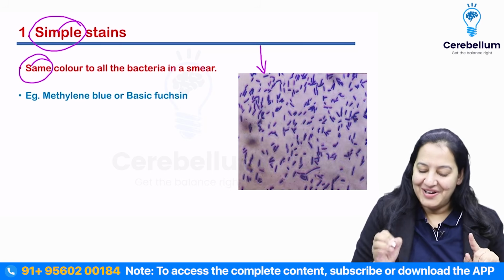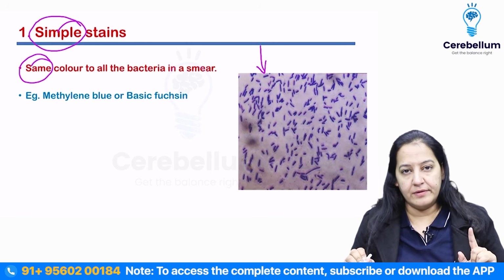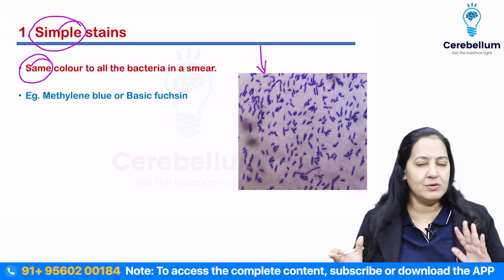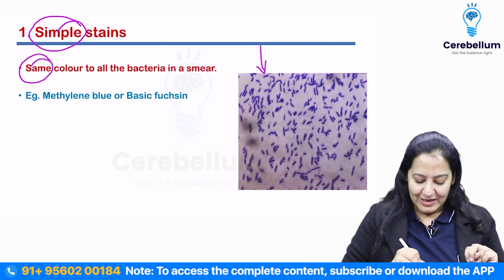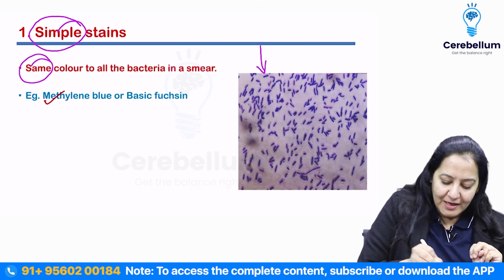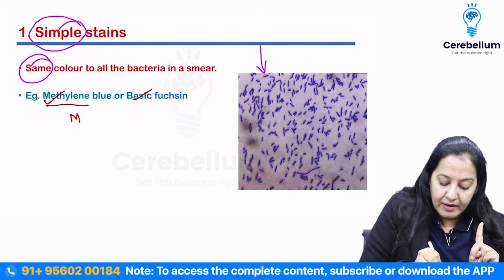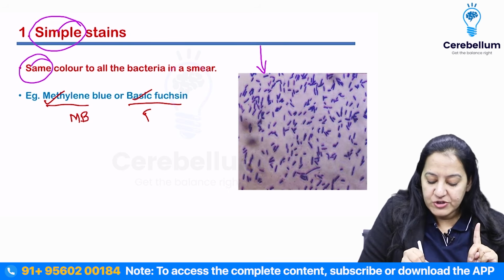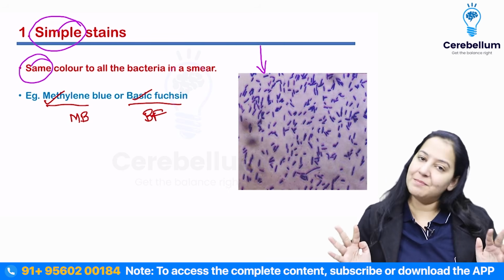Can you see the slide? All bacteria are the same color. I can see all bacteria are blue. They are all blue. There are no different types of color. That's why it is known as simple stain. There are 2 examples of simple stain you have to learn. Methylene blue and basic fuchsin. It's methylene blue, number 1, and basic fuchsin, number 2. So these are the 2 examples of simple stain.